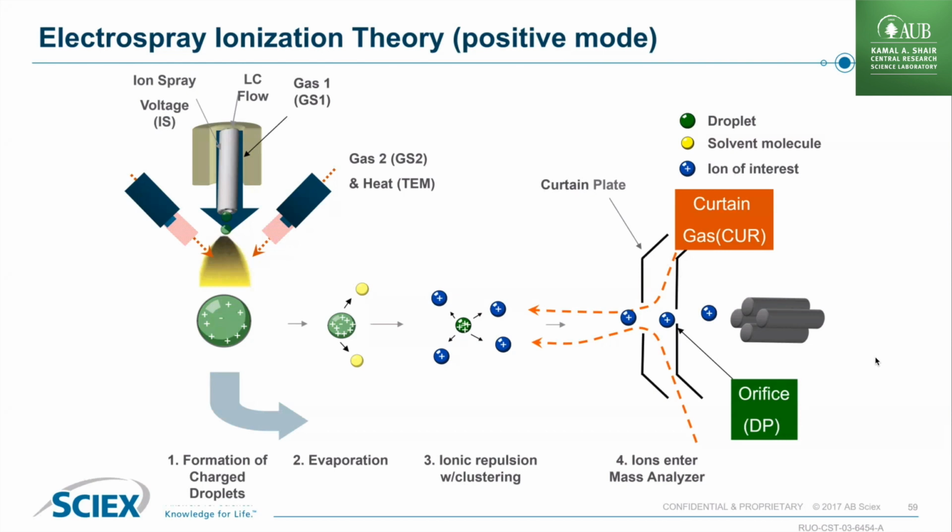It's a beam of ions created by the source in the gas phase, which is then continuously entering into the instrument. So we have a continuum, and if we connect this up to a chromatography system, it's perfect, right? So the LC is pumping, peaks are coming and going, and this process is a continuum, constantly producing the ions that are fed into it from the chromatography system.